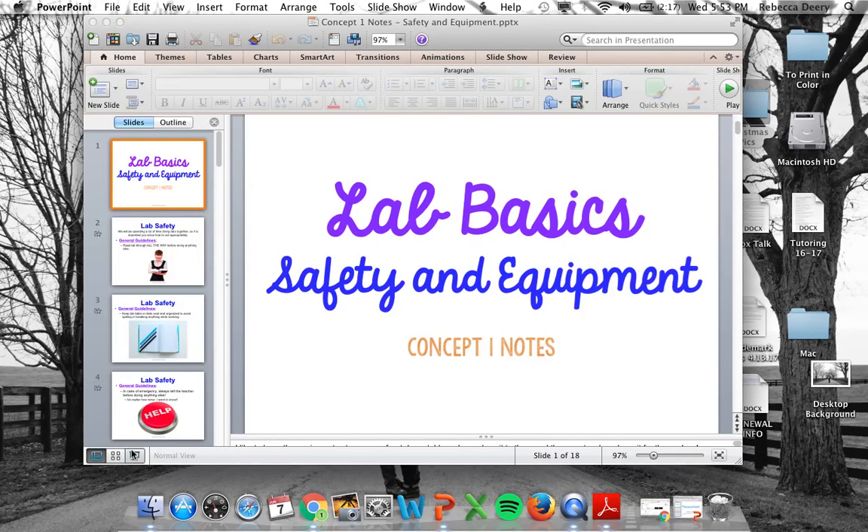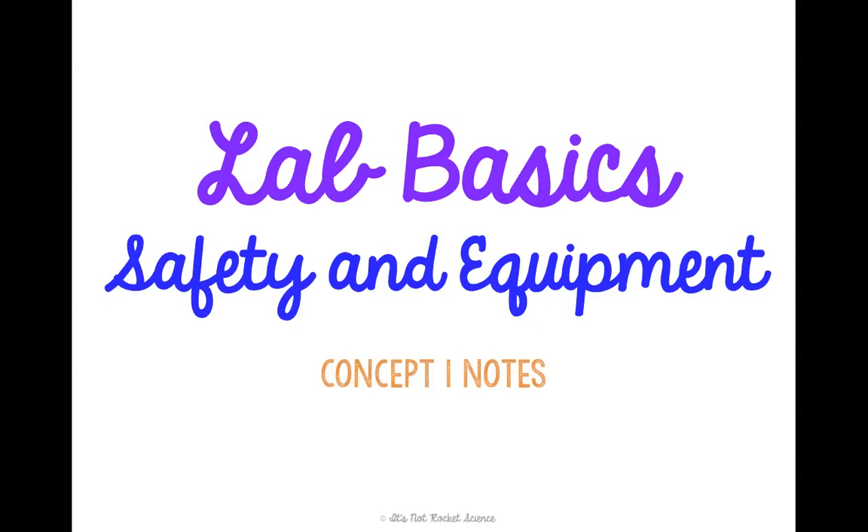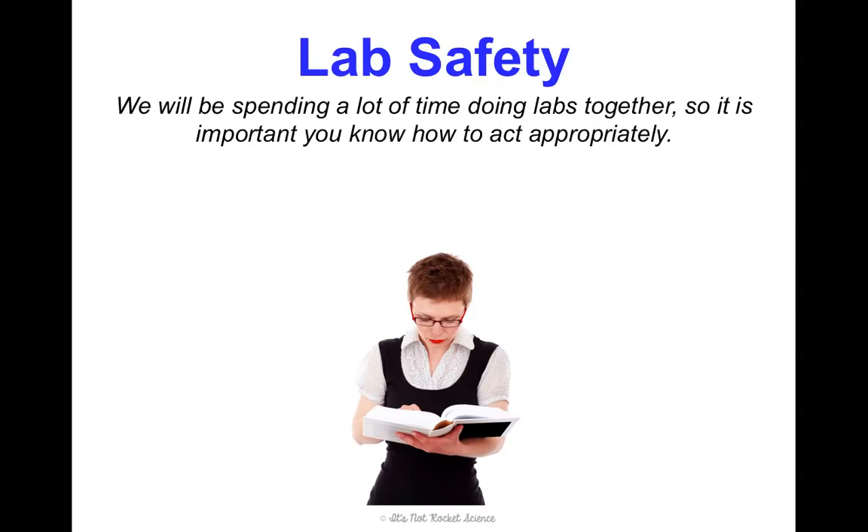Welcome to physical science. We're going to get started with unit one, concept one notes about lab basics. We're going to talk about safety and equipment. This class has a ton of labs in it, so even though some of this may be stuff you've learned before, it's really important that we go over how to act appropriately and what equipment you're going to be using so that you're prepared.